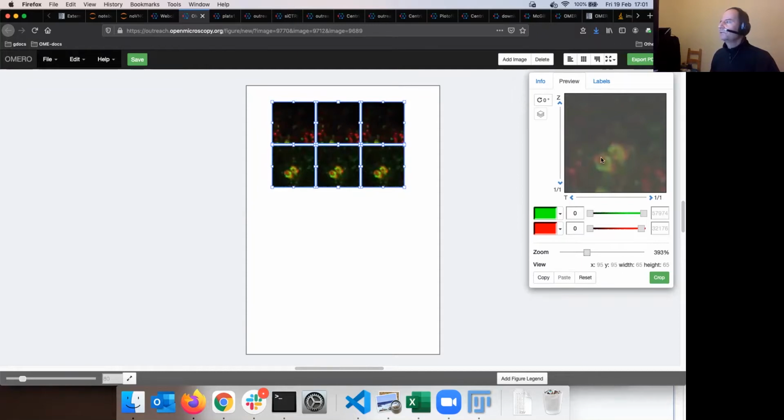The bottom part is almost nice, but the top part is different. I will need to adjust it separately. And I do it like that. So I select just the top row and adjust the top row. Now I'm happy with the display inside the panels.